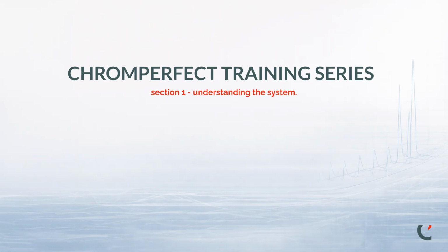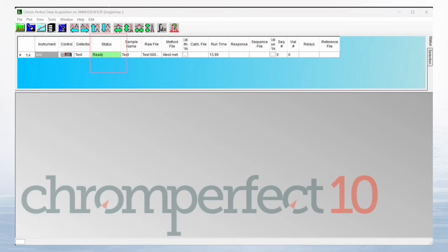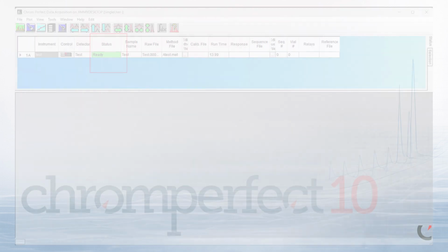We are currently in Section 1, Understanding the System. In the previous chapter, we introduced the overall system architecture. In this chapter, we are focusing on understanding instrument status states. This training series is designed to help you understand how Chromperfect works. It is not intended to troubleshoot hardware connections, driver configuration, or communication faults. Today, we will explain what the different status messages mean and how to interpret them.